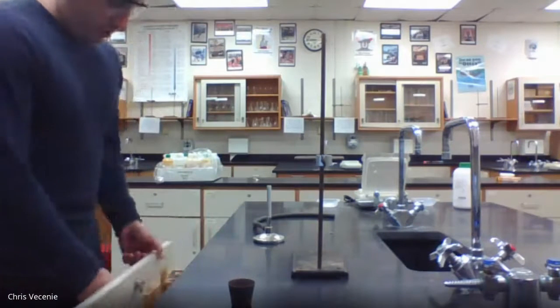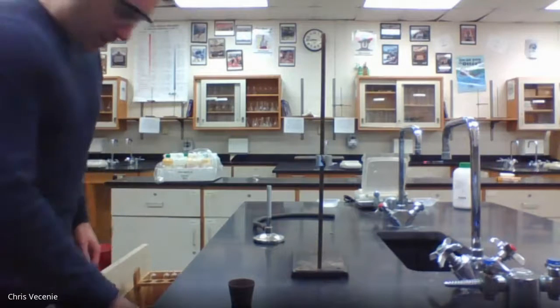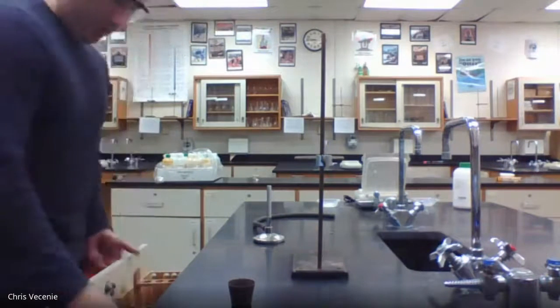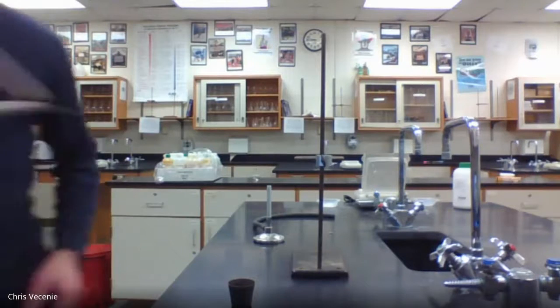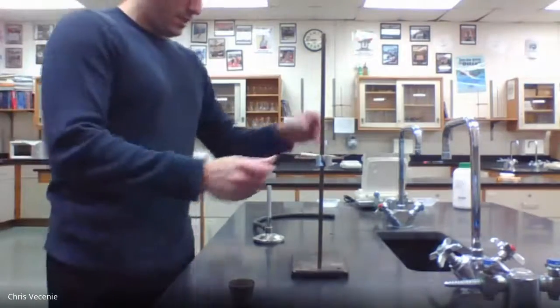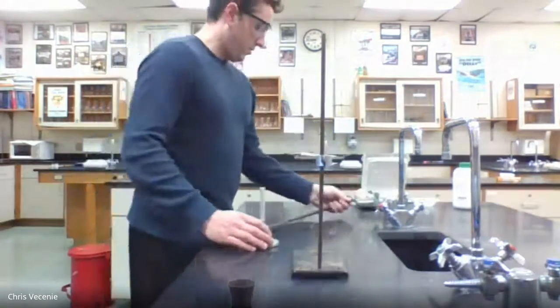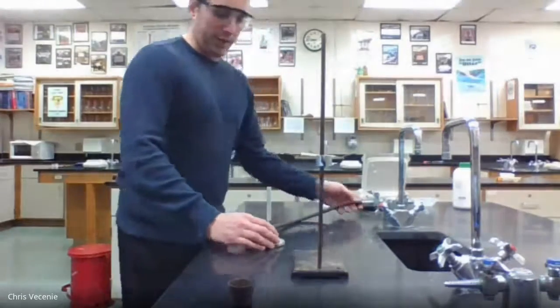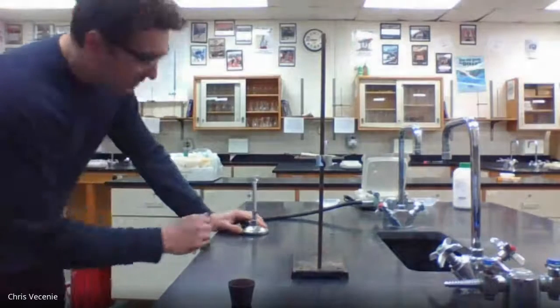All right, so to do that, I'm going to go into my drawer. And I'm going to get out my pipe stem triangle. I'm going to check my gas. It's like we have good gas there. Plug in my Bunsen burner. Bit of a review, right? Hopefully we'll all be back together soon.